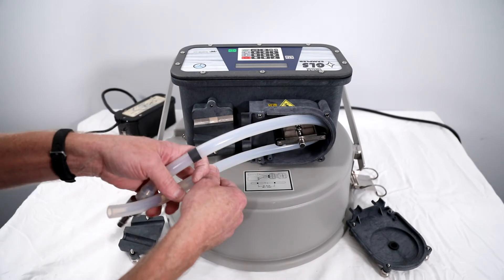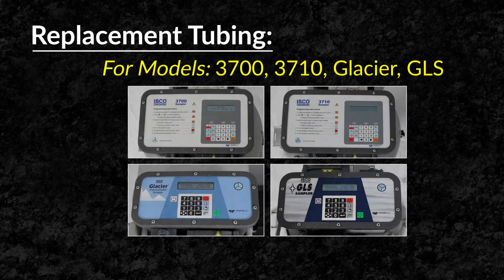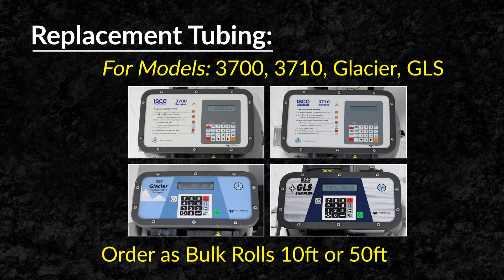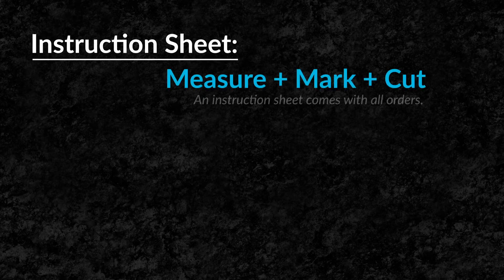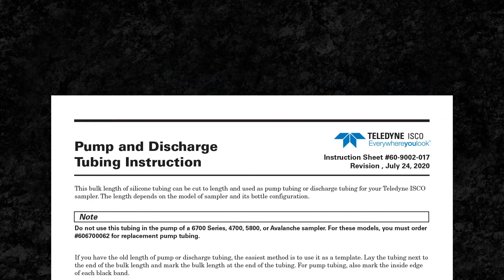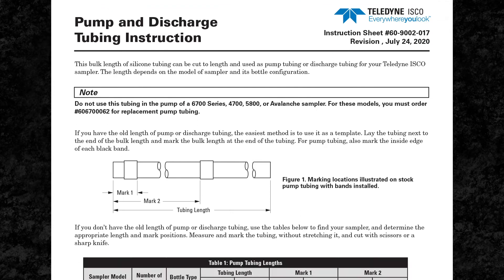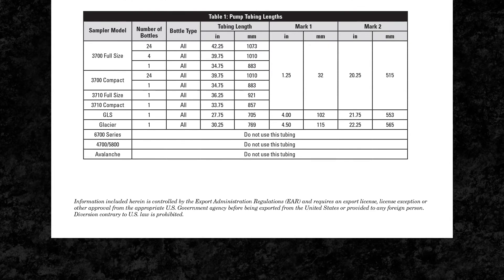It can be helpful to rotate the pump rollers by hand in this process. Replacement tubing is available in bulk rolls of 10 feet and 50 feet lengths. Each bulk roll includes an instruction sheet that shows you how to properly measure, mark, and cut your replacement tubing depending on the sampler model and the specific bottle configuration.